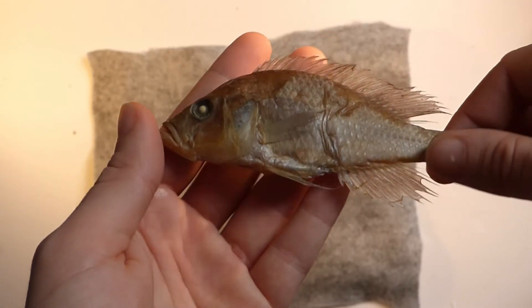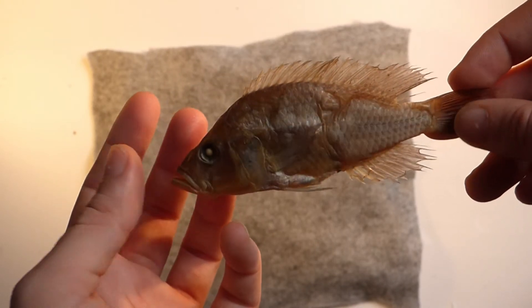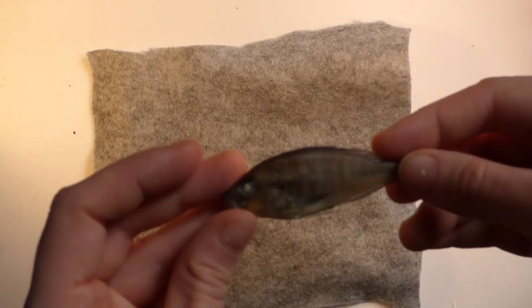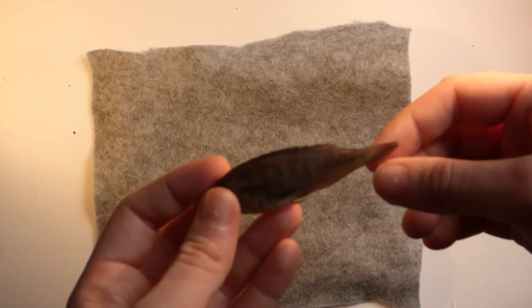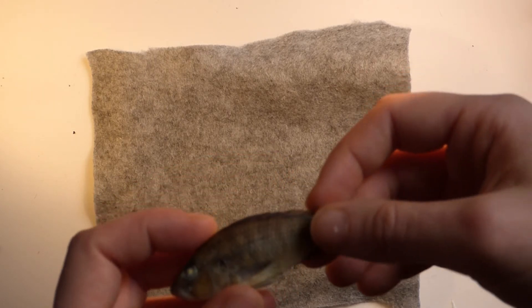Sometimes you'll have a fish where the fins are all nicely pinned out and you can see where they start and end, and you don't actually need to pin them out. But more often than not you'll have a fish where you can't really see exactly where the fins start and begin, so with a fish like that you will need to pin it out — I'll show you how to do that.